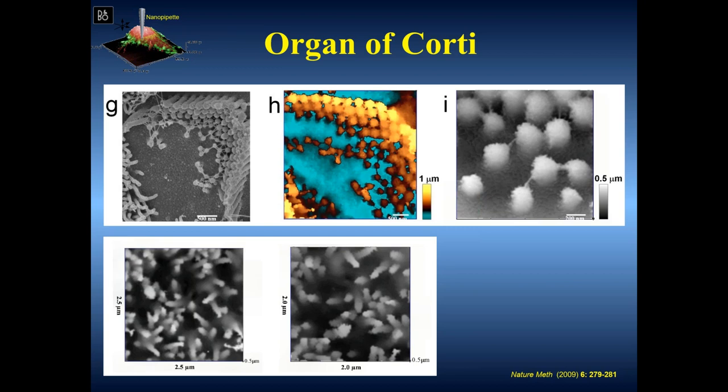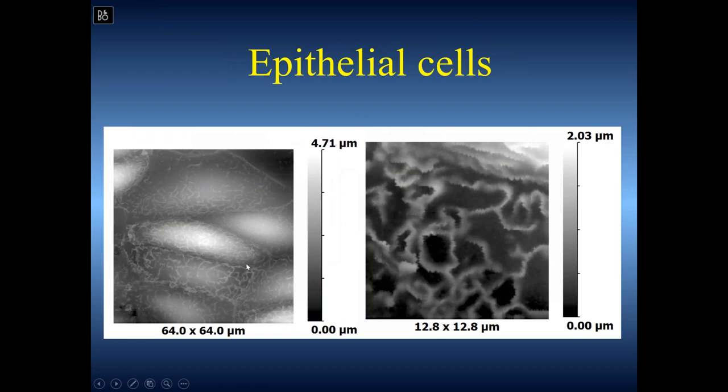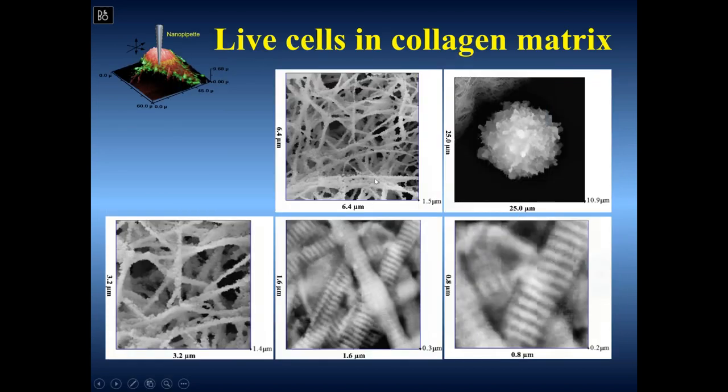Another example is cardiomyocytes — a large, very structured cell, not attached to the substrate. You can image and look in detail at the z-line, sarcomere, and t-tubule entry. Epithelial cells with microvilli and ridges — kidney epithelial — form very interesting, incredibly dynamic structures up to one or two microns high. We can also study hydrogel, which is very difficult for any other scanning probe microscopy. This is a collagen fiber with a cell growing in this matrix.